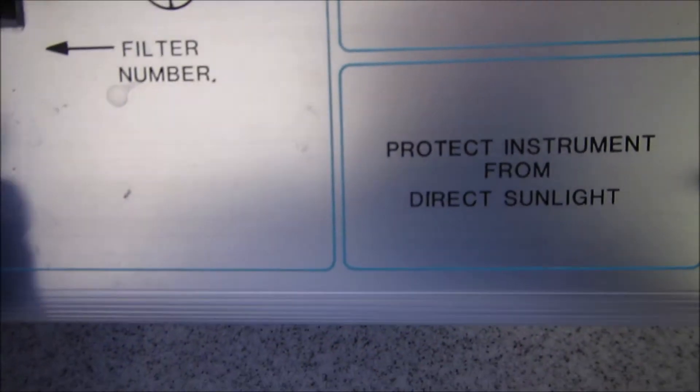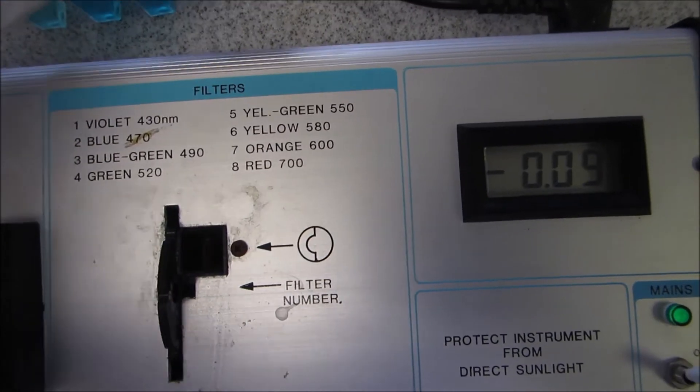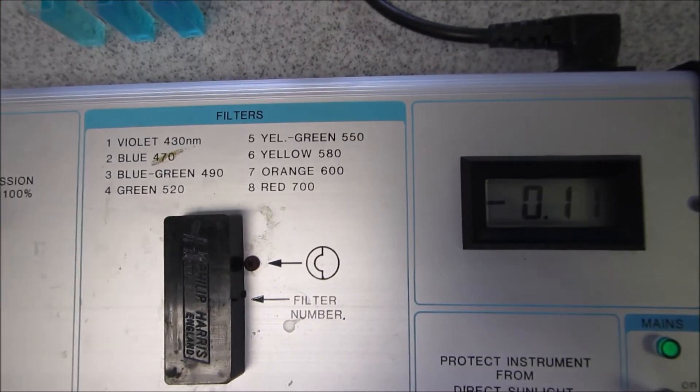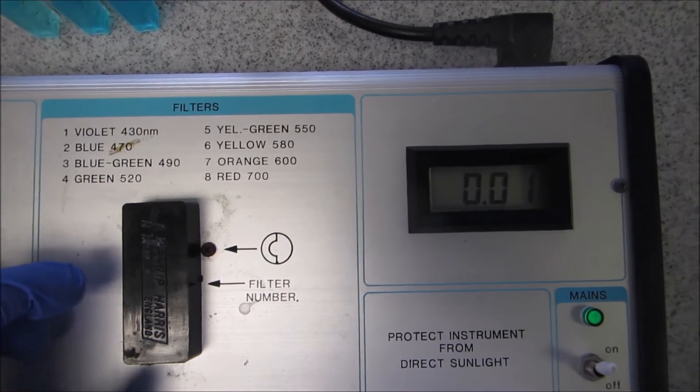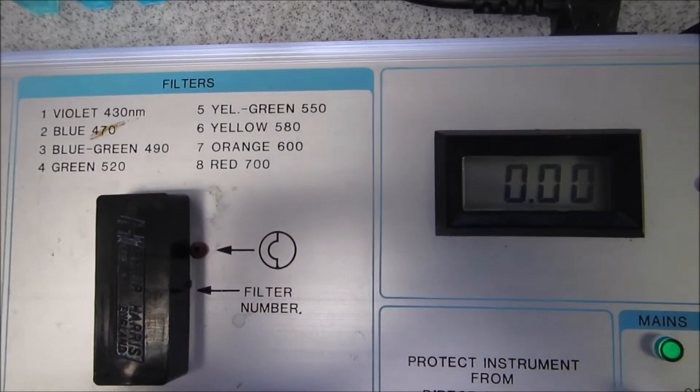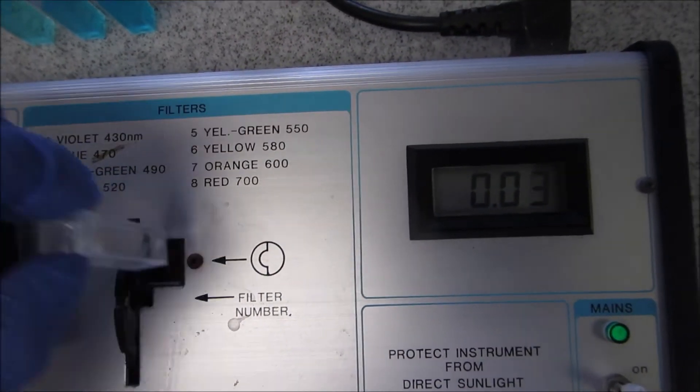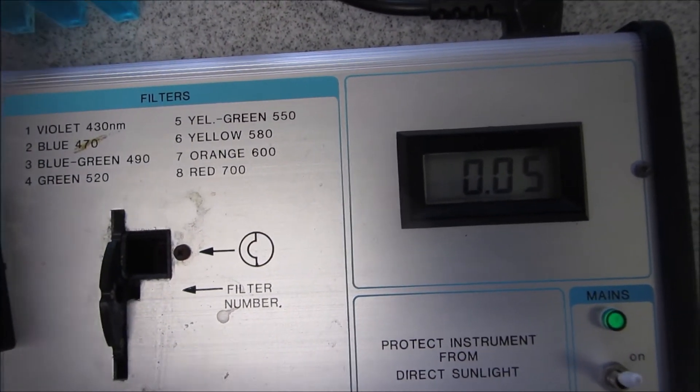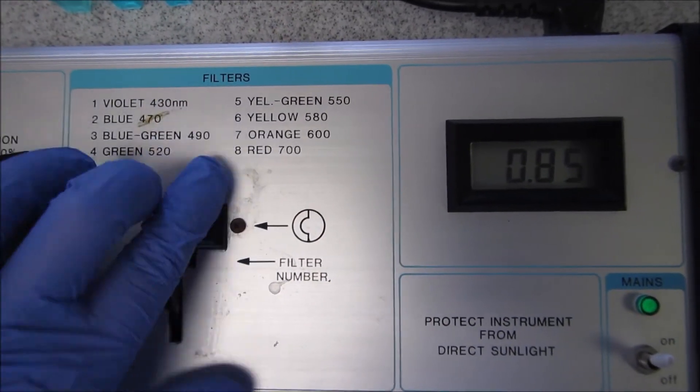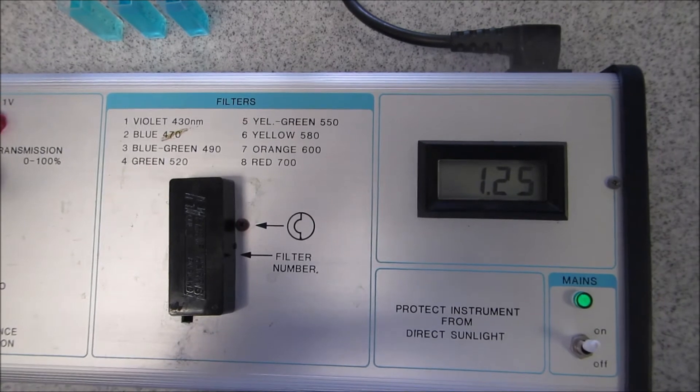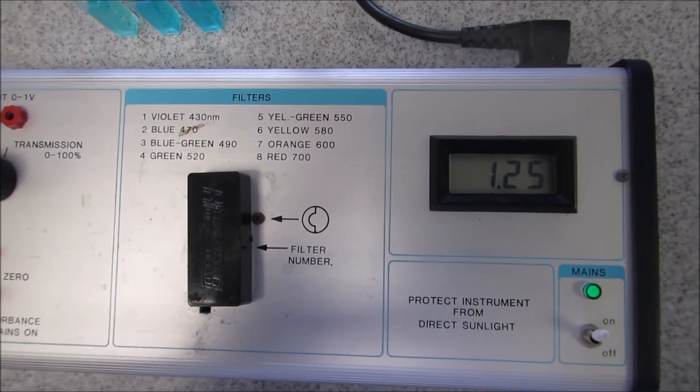So now we're on number 7 which is 600 nanometers. Again I'll blank it and zero it on the blank, then put in my 1 molar. Now you can see that you're starting to get quite a high absorbance. That's what we're looking for.